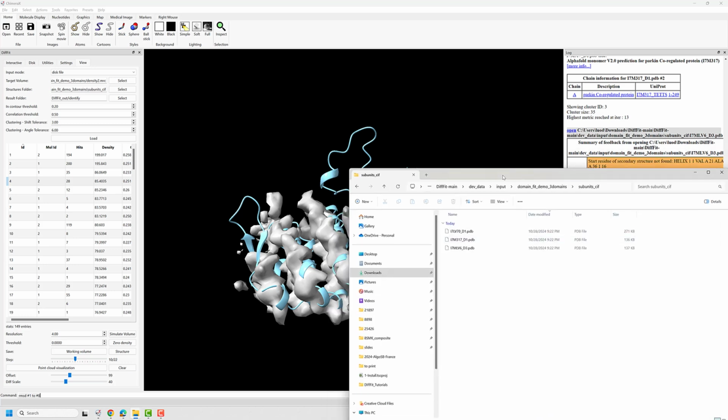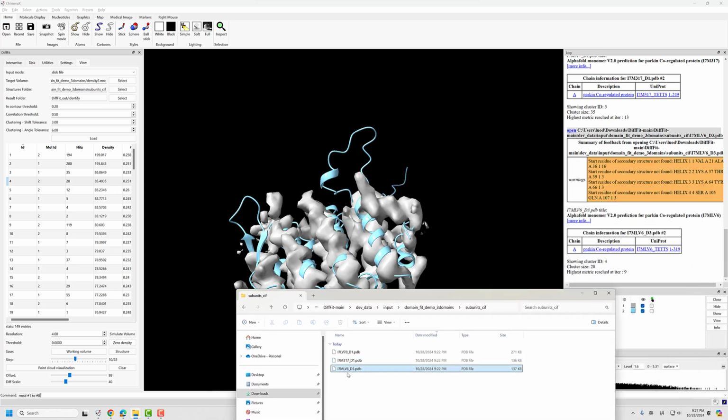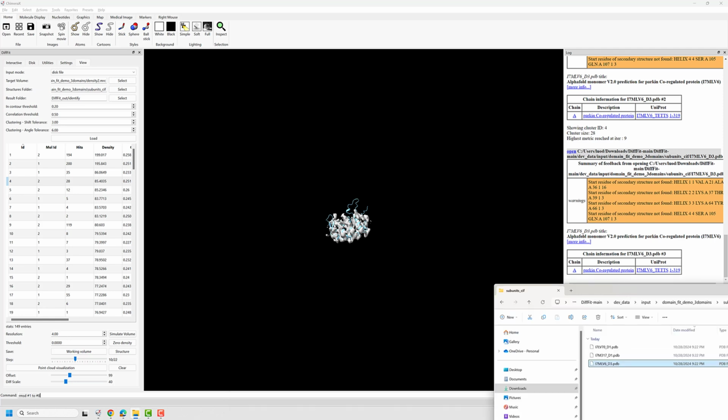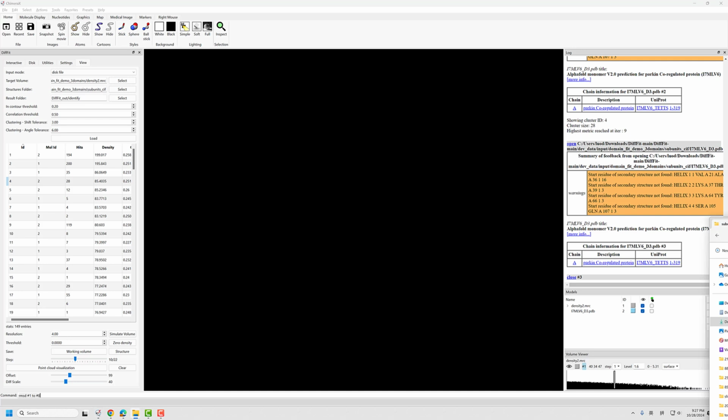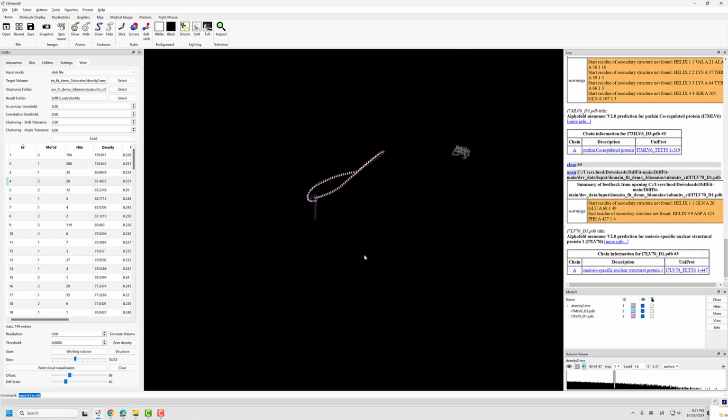It's here. The third one is, I think, this one here. Oh no, actually not this one. Probably this one, yeah. The third one is this one.